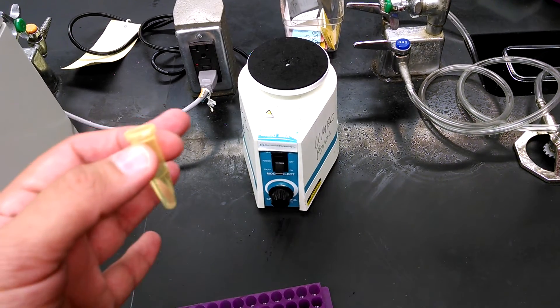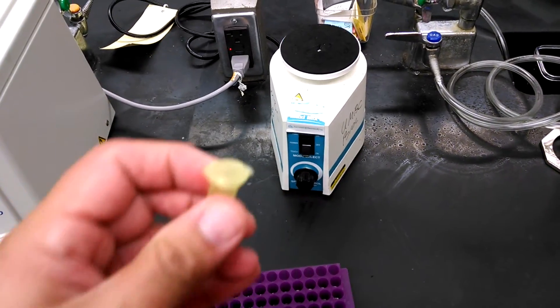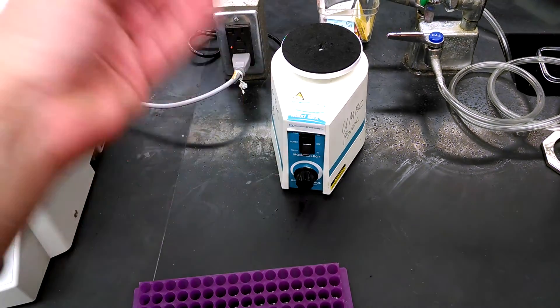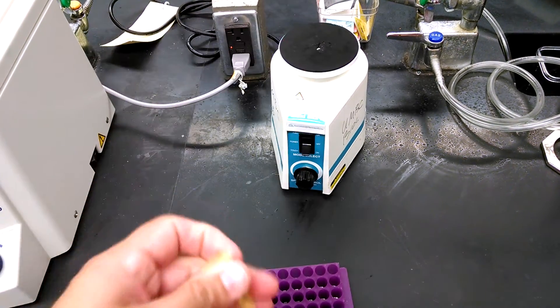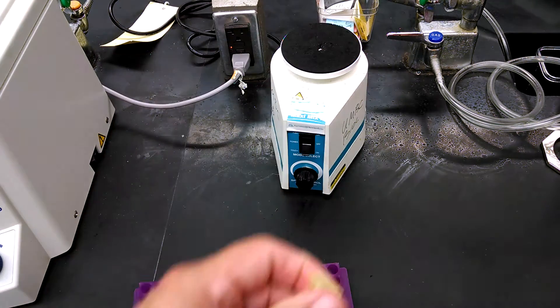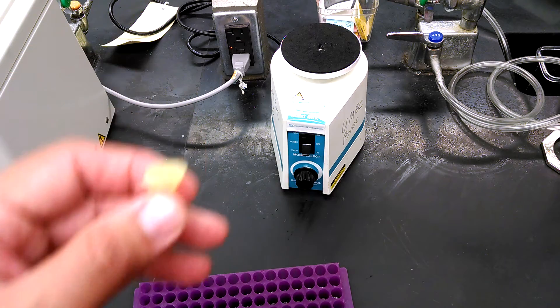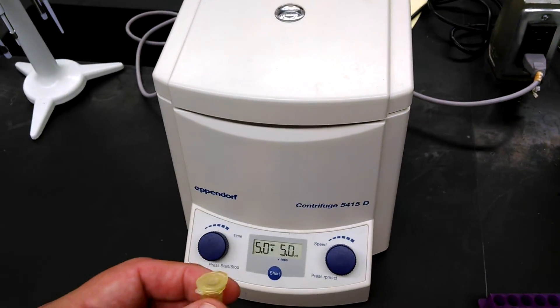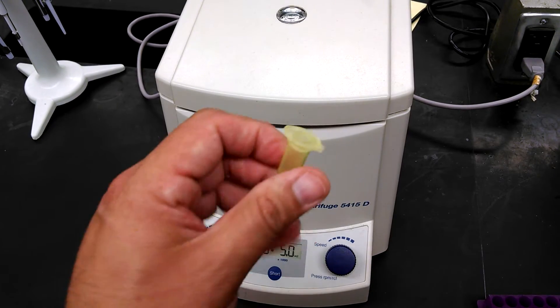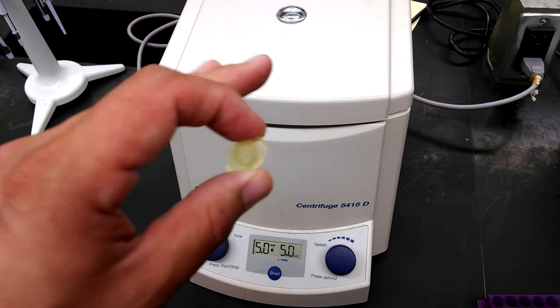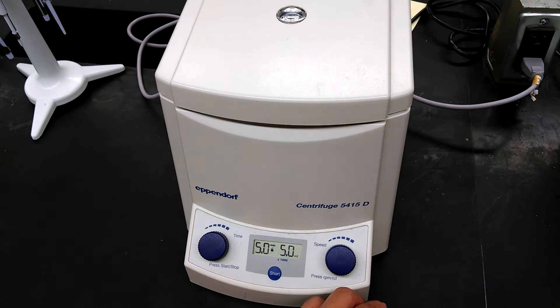And then it tells you to heat it up to 56 degrees for five minutes, and then come back and vortex it again, and then back to 56 degrees, and then vortex it again, and then to 100 degrees, and then to centrifuge it. And so when you are centrifuging, make sure you follow the actual procedure, not mine. I'm demoing the actual little steps.